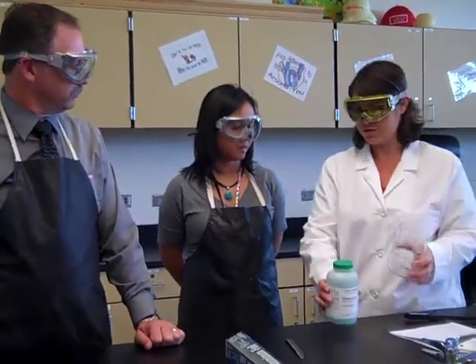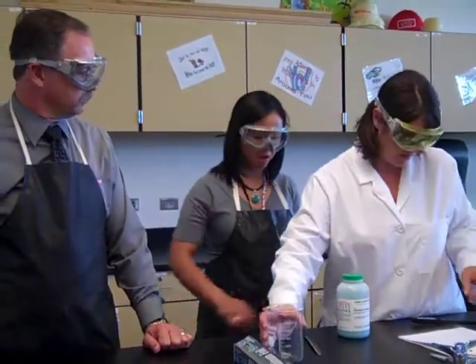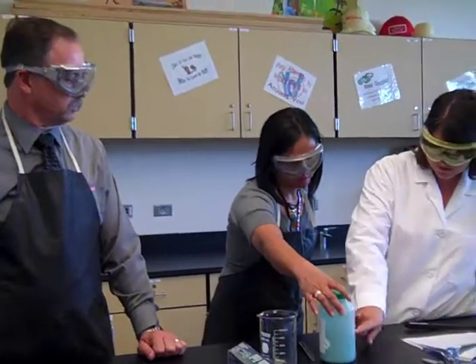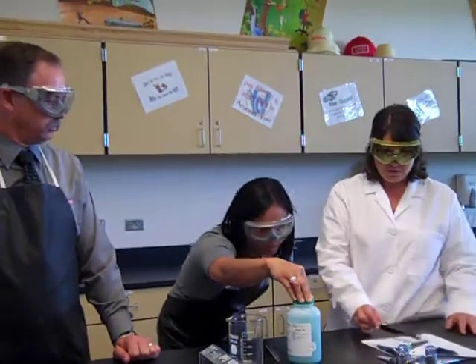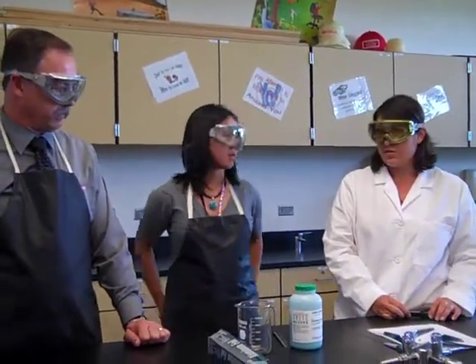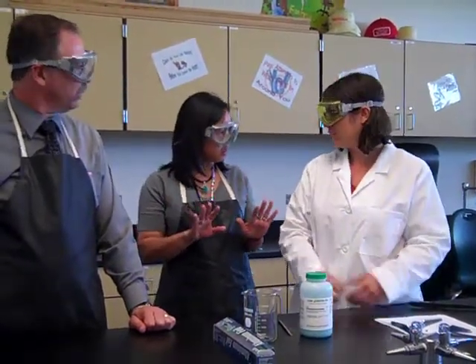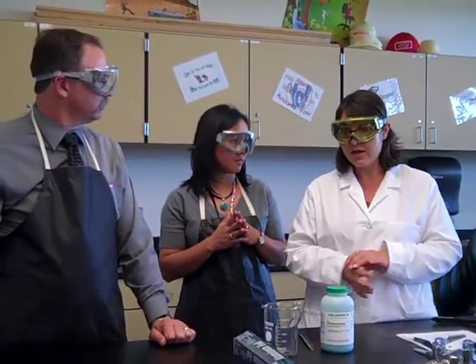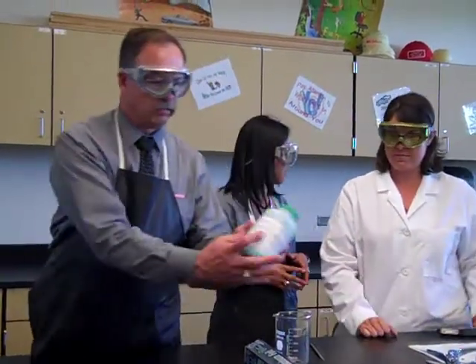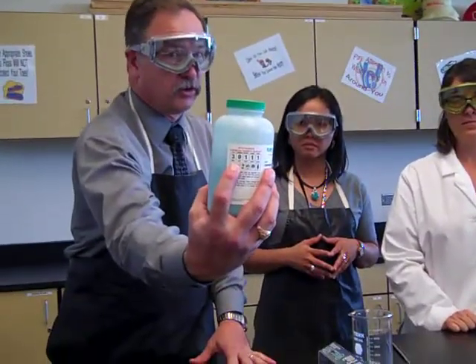Is it okay for a student to scoop out their own copper chloride? Copper chloride has a lot of safety symbols on it, but corrosiveness is the main issue. Only somebody wearing gloves can dispense this, and we don't have enough gloves for everybody, so teachers will be the ones wearing gloves and dispensing this chemical. Looking at the numbers on the side, the corrosiveness shows a three, which means we need to be extra careful.